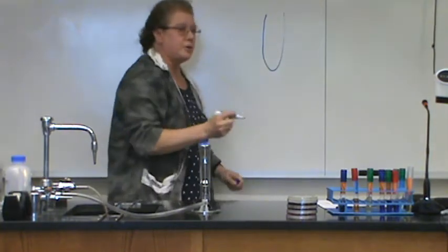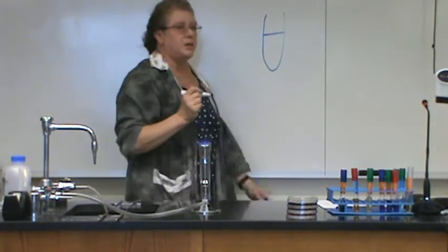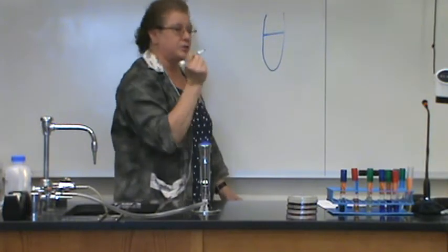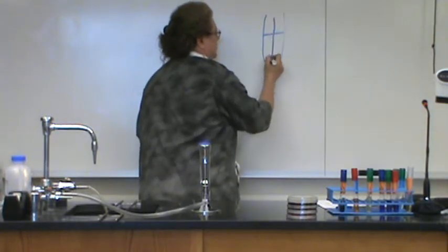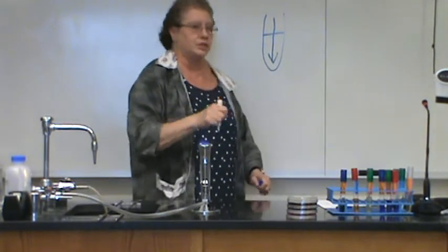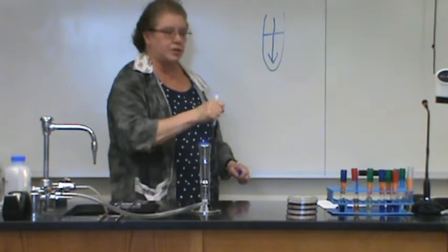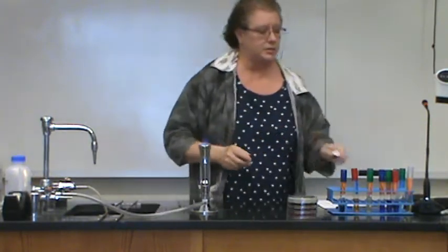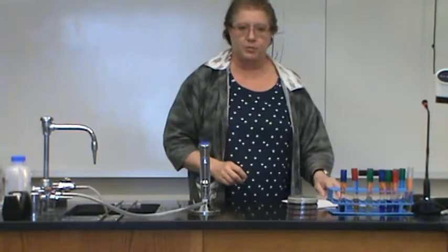So you have your tube. Okay, it's got the SIM media in it. You take your inoculating needle, get some bacteria on it from your unknown culture, and you stab it down into that semi-solid media. So you're getting it right down into the bottom of the media, all the way up to the top. Okay, so that is a new technique that is used for that type of media.